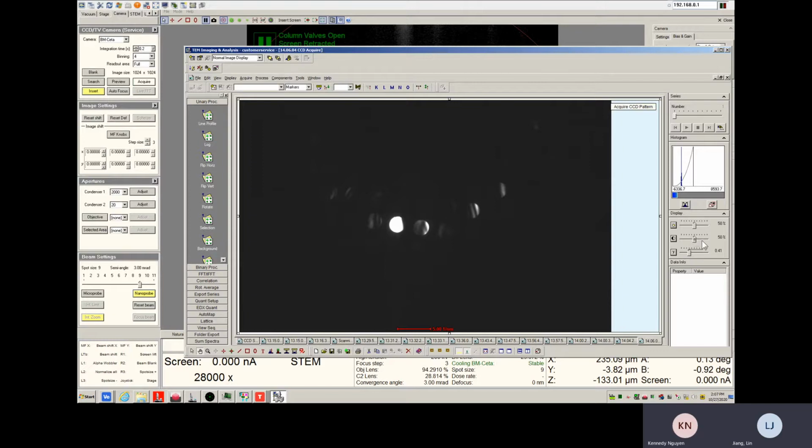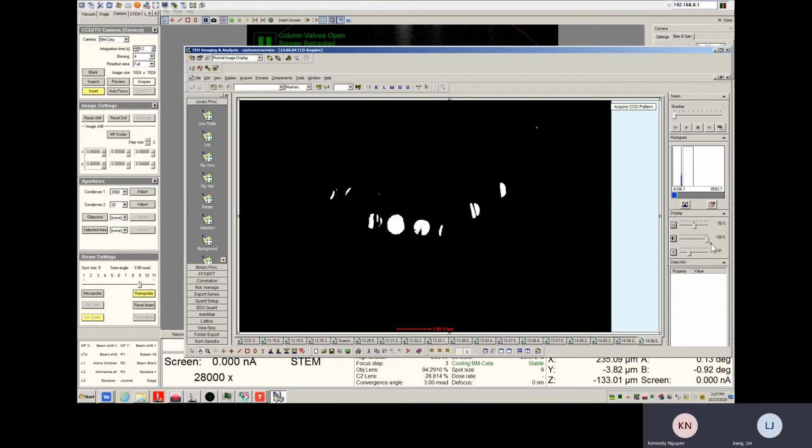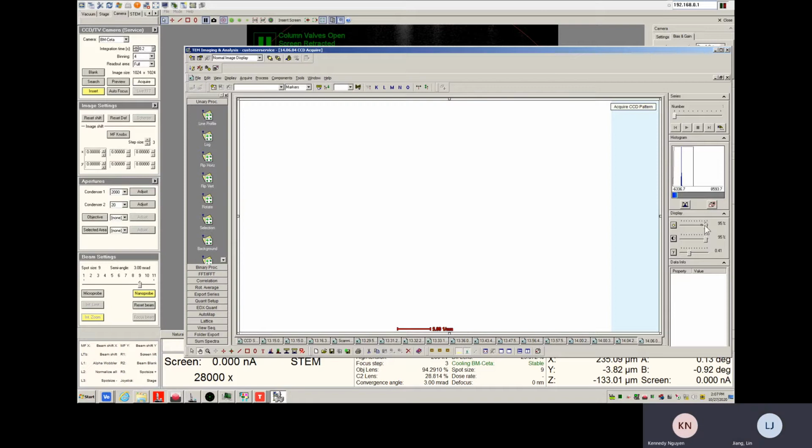It's still different information, right? Is it looped like this because it's a non-flat surface? It's not on the zone axis. I think this one is tilted a little bit, right? Okay. Let's see if we adjust the brightness. We could check the Kikuchi lines if they appear, right?